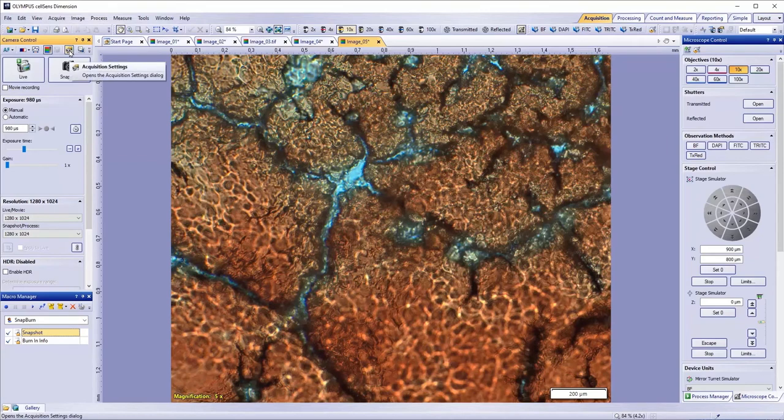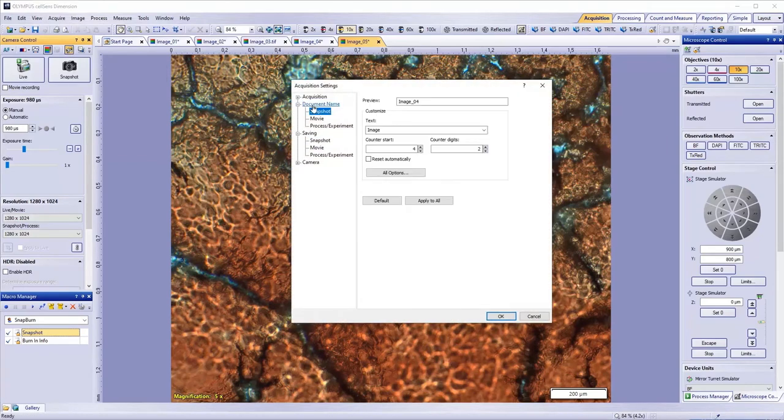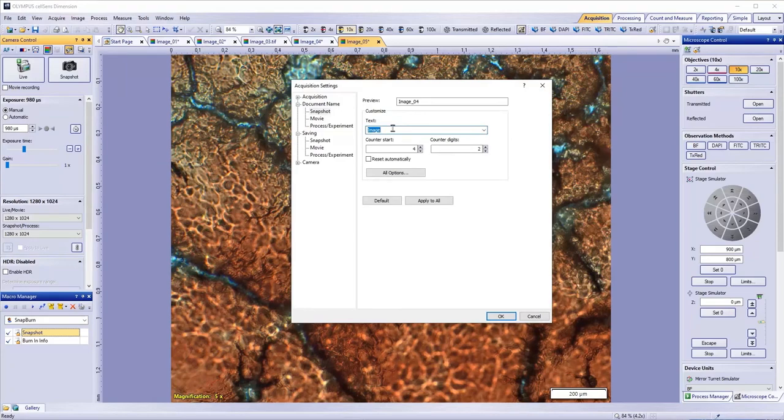In the Acquisition Settings, go to Document Name, then Snapshot. Click Customize, and then Text. Now you can enter a prefix you would like to use in your image names. The default is Image. In the Preview area, you can see how your images will be named.